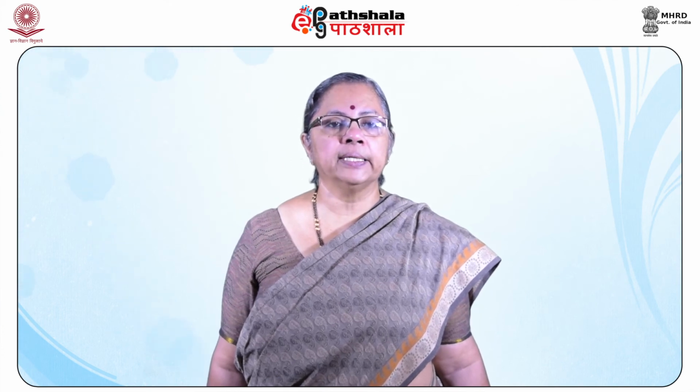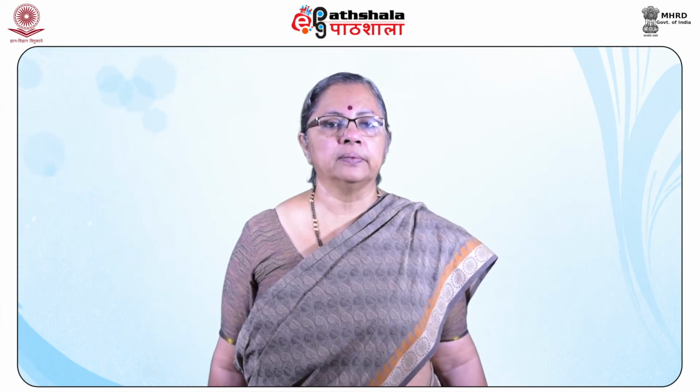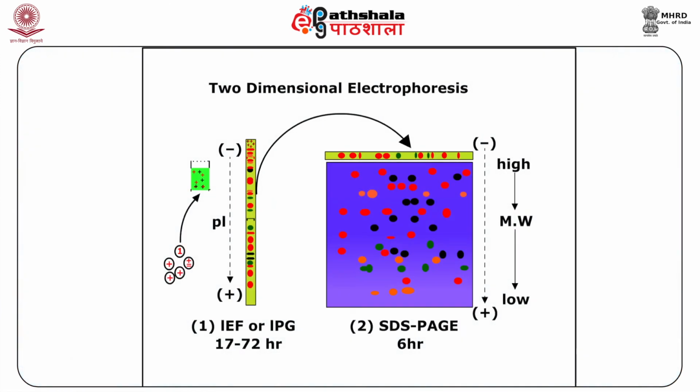This is possible by using low molecular weight organic acids and bases, namely ampholytes, in the capillary tube containing the polyacrylamide gel. The ampholytes distributed in an applied electric field, as indicated in the figure, set up a pH gradient. The separating polypeptides come to rest where their respective isoelectric pH matches that of the ampholyte.